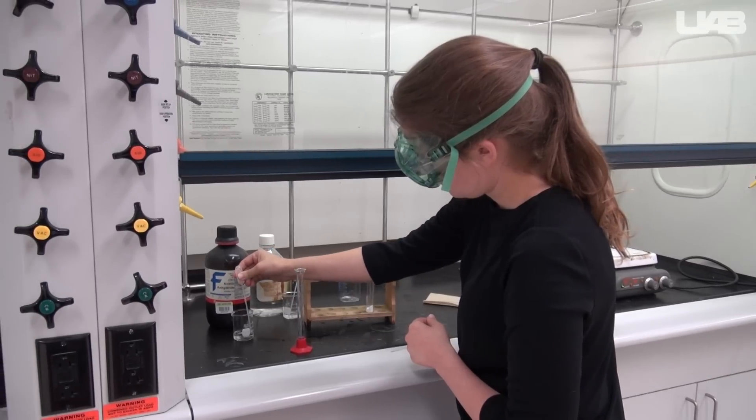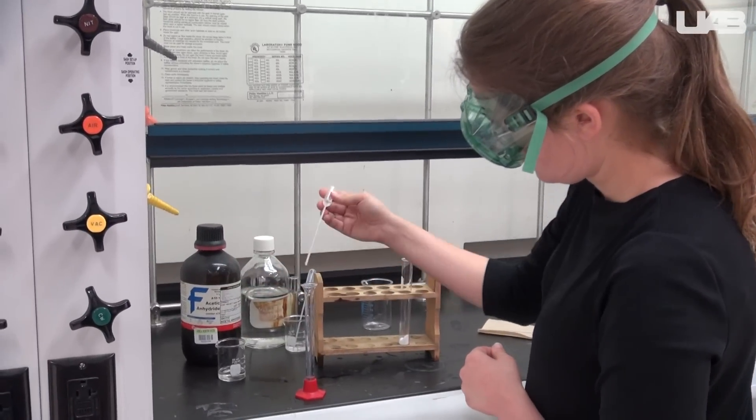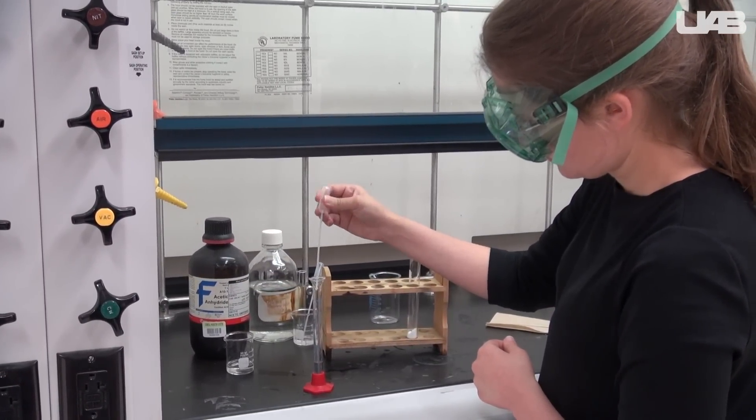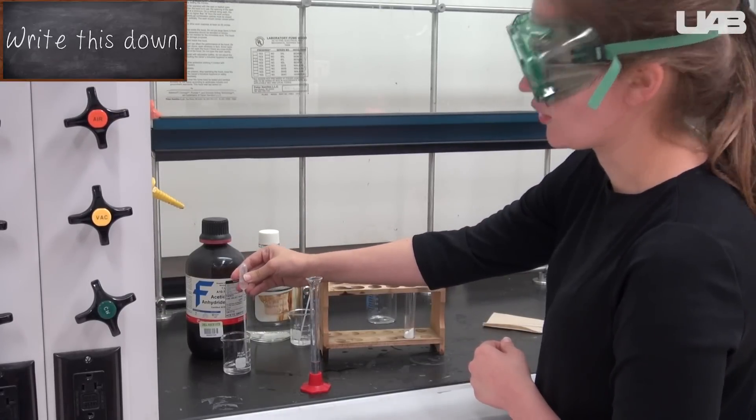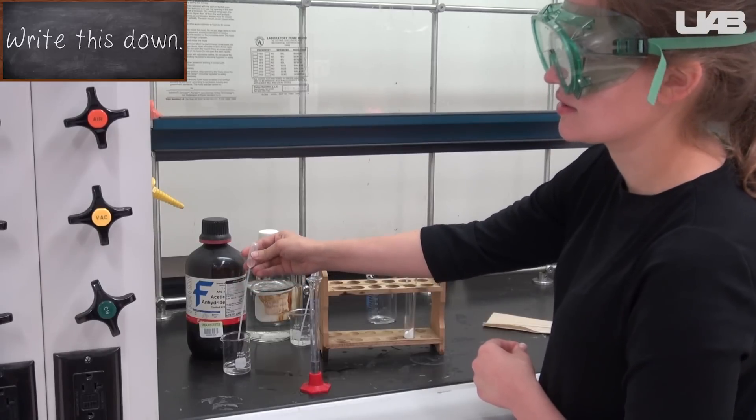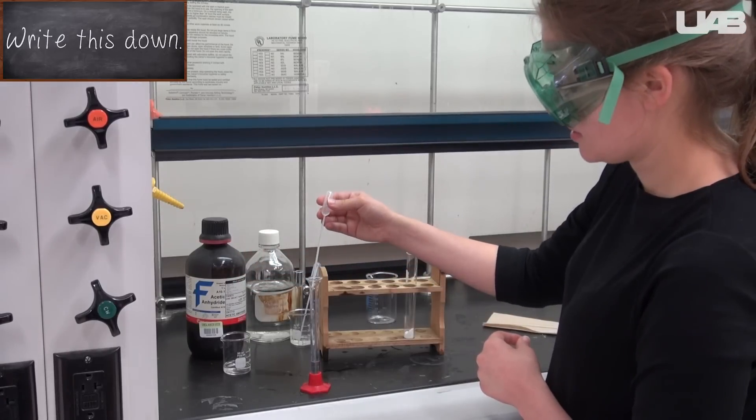You will find the acetic anhydride in the fume hood. Obtain about 3.5 milliliters of acetic anhydride. This chemical can be dangerous, so make sure you are never pointing the open end of the test tube towards yourself or anyone else.